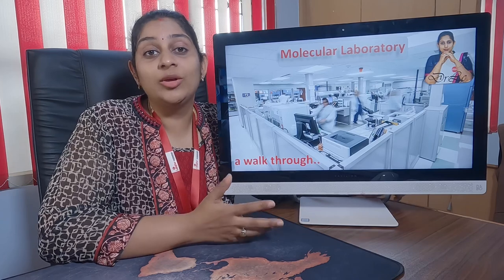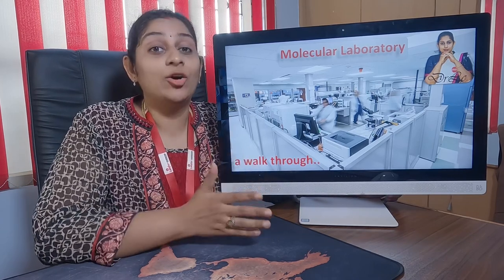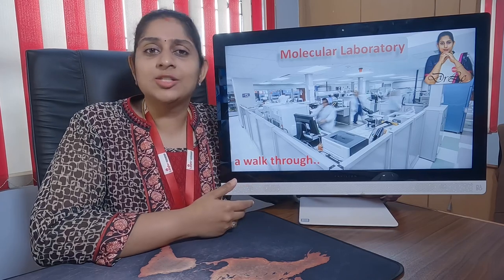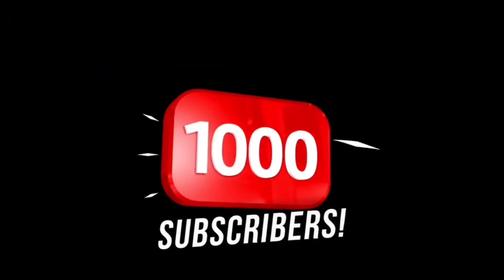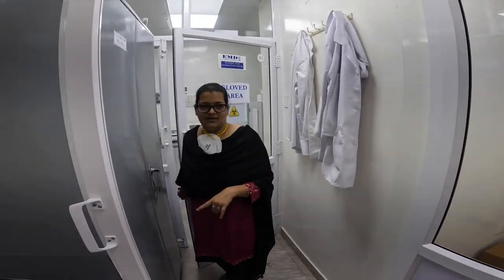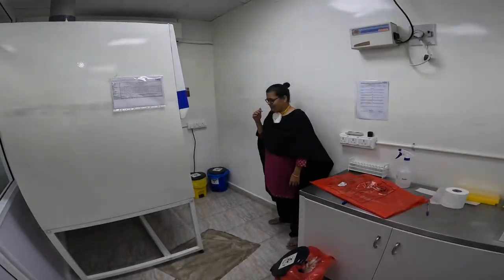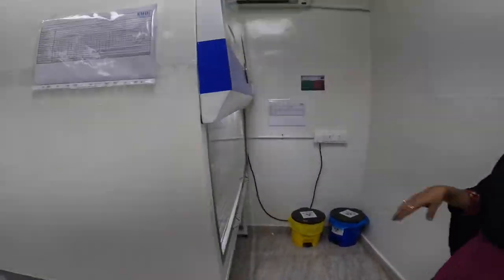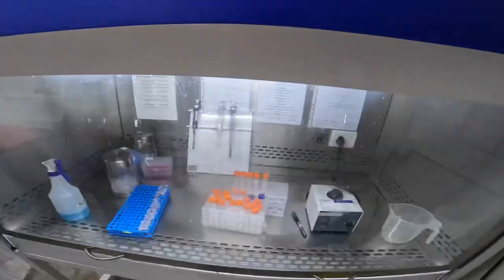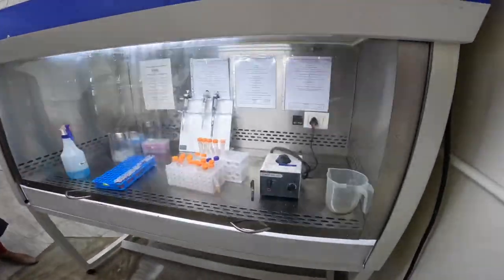And in this video, we're going to see in detail how this laboratory is set up full-fledged according to the NABL norms. Come, let's go into the video and see how this laboratory works and functions. We have three rooms, and this first room, which we call the biosafety room, has the biosafety chamber, or the biosafety cabinet, installed. We have different grades, and according to the NABL standards, they have already installed this biosafety cabinet.